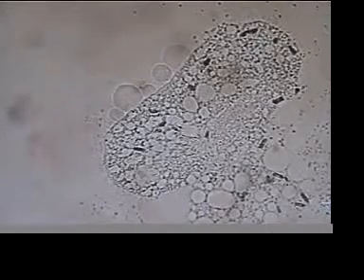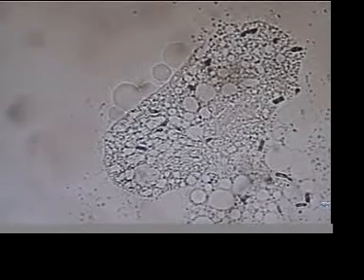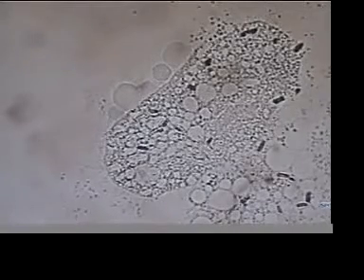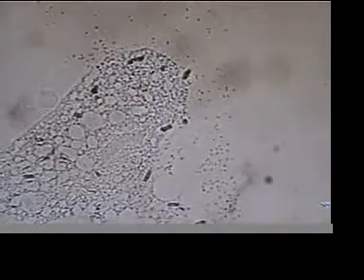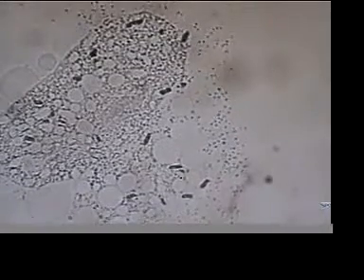Paramecium, undergoing complete, utter, total destruction. Let me move him a little to your left there, so you can see it a little better. You see all those spheroids that form? That's very interesting and unique to this process. We can probably highlight those outlines by changing the focus a little bit. Lots of spheres everywhere.